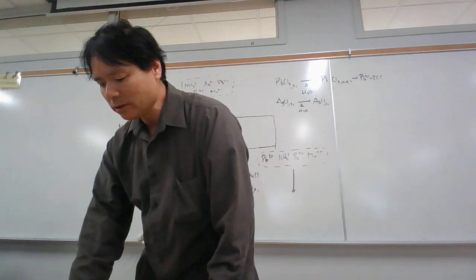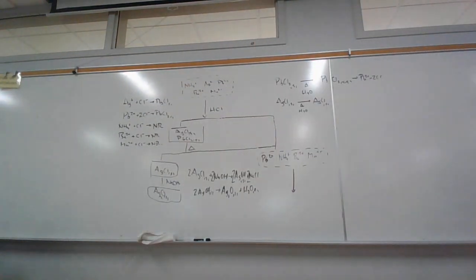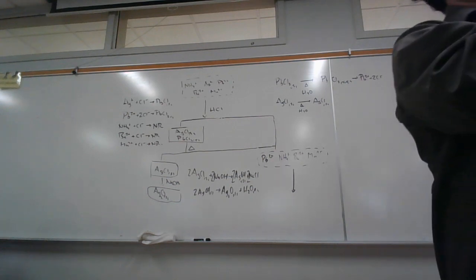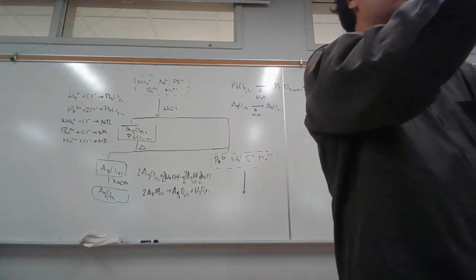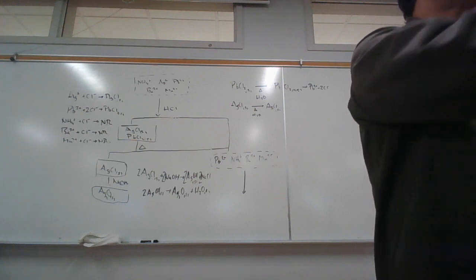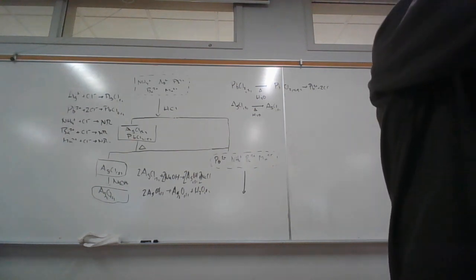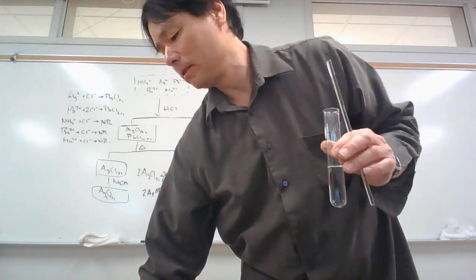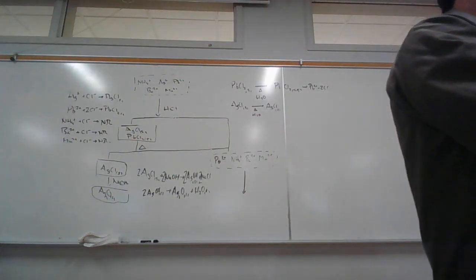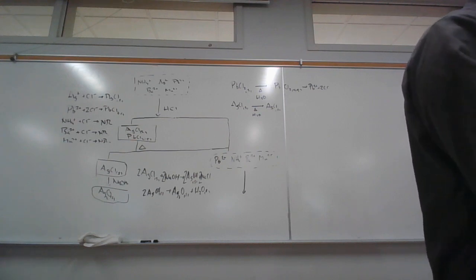Now, when we pour solutions in here, let me just show you how we pour solutions. So let's say this is cloudy with precipitate here. If it's cloudy with precipitate, then what you want to do is 2 things. One, either stir it up and dump it in here. But if you stir it up and dump it in there, it tends to clog the filter paper more quickly. And so normally what we do is we don't stir it up and we just pour this. But there are 2 beakers that you're going to have under here. One beaker is going to be for your filtrate. The other beaker is going to be for your waste. So you got to make sure you have the right one under there.